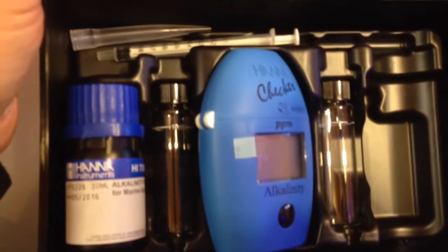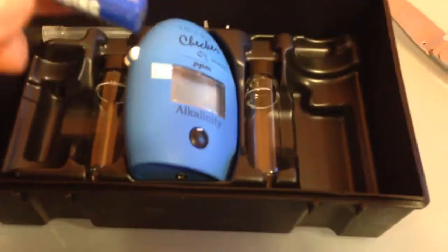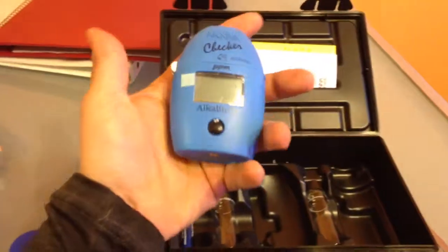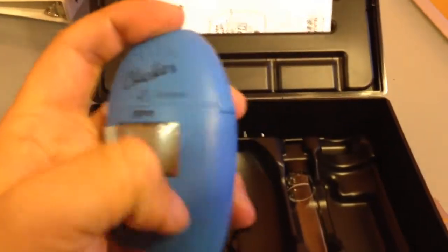It's got some syringes and a tip, the liquid, and two of the tubes. There's also alkalinity solution — I thought that was a little bottle of solution. That's the battery, which is good that it comes with one. The thing actually turned out bigger than I thought — I thought it'd be small. It's pretty big, fits your hand nicely, but it doesn't feel like it's made from super sturdy material — it's kind of plasticky.